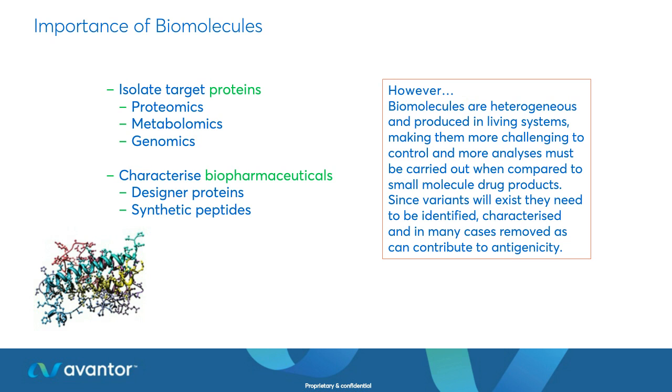So we need to properly characterize these very complicated molecules, and chromatography is a wonderful tool to be able to do that.